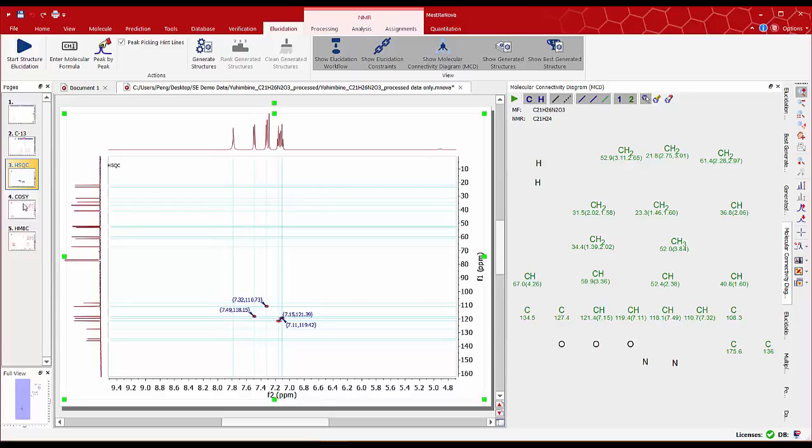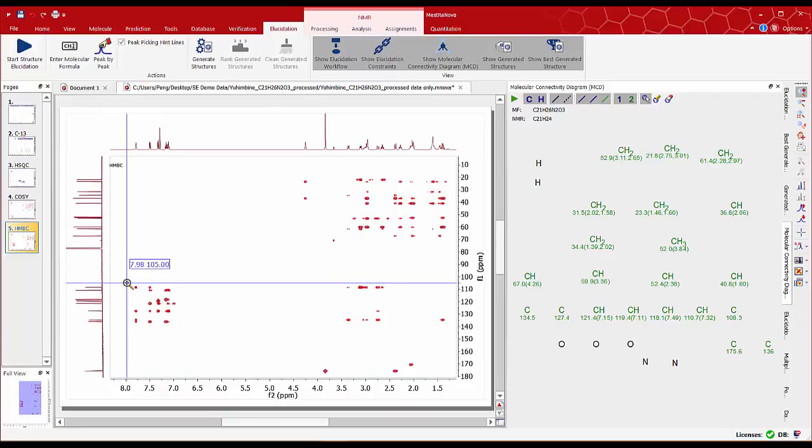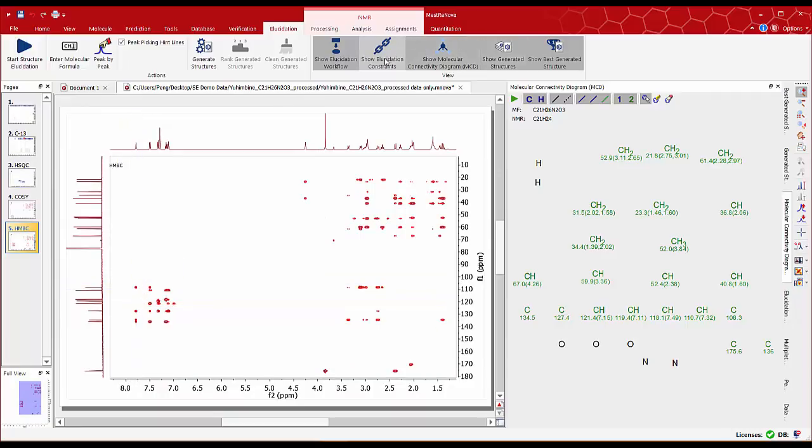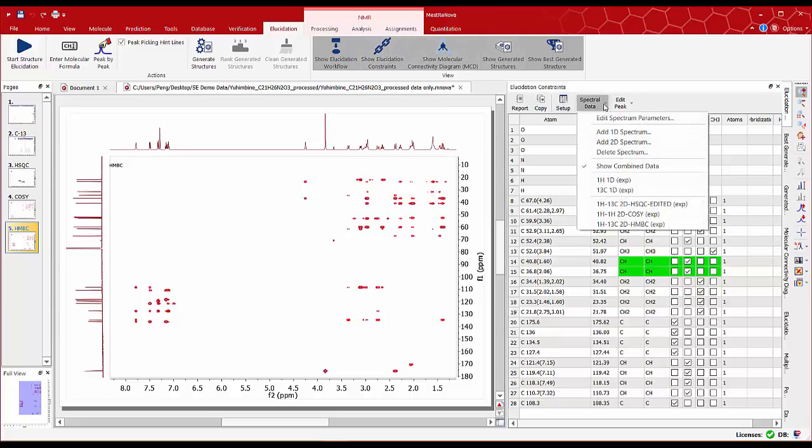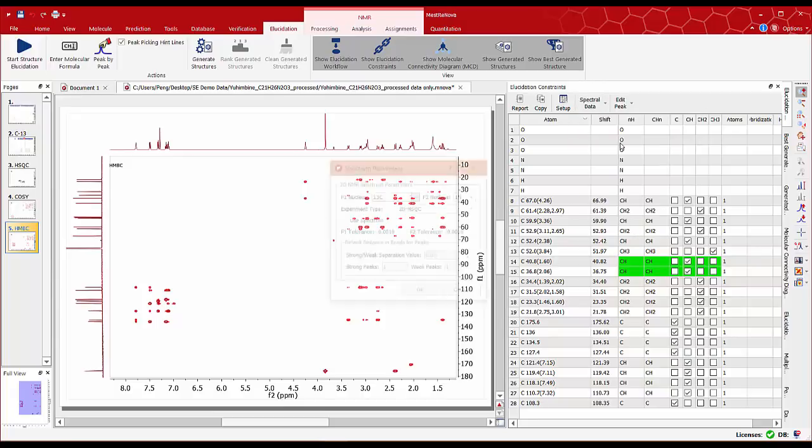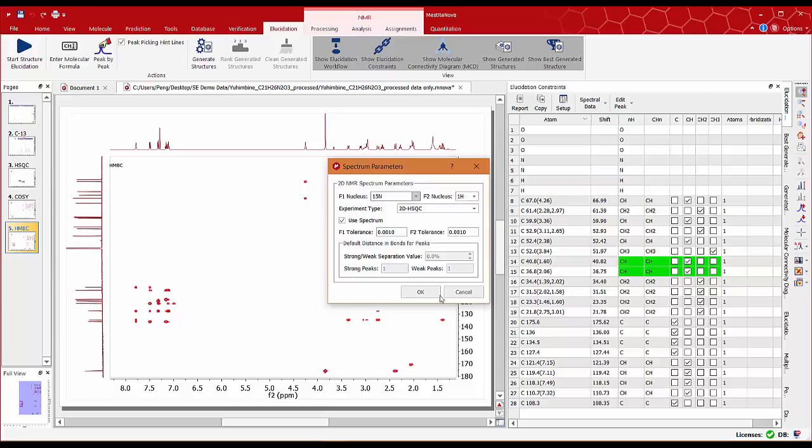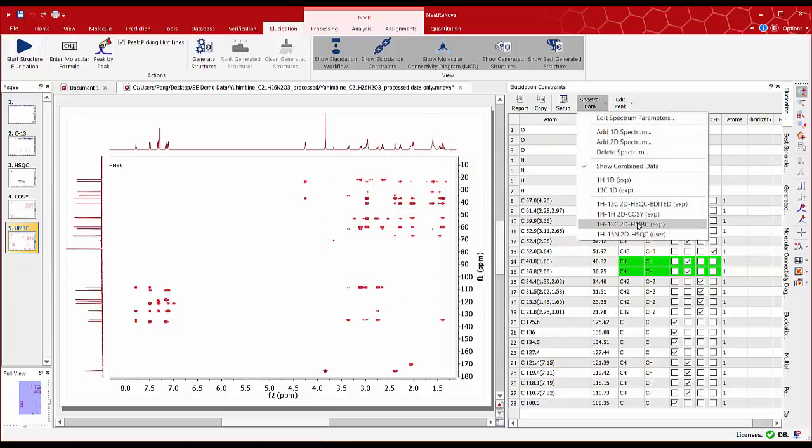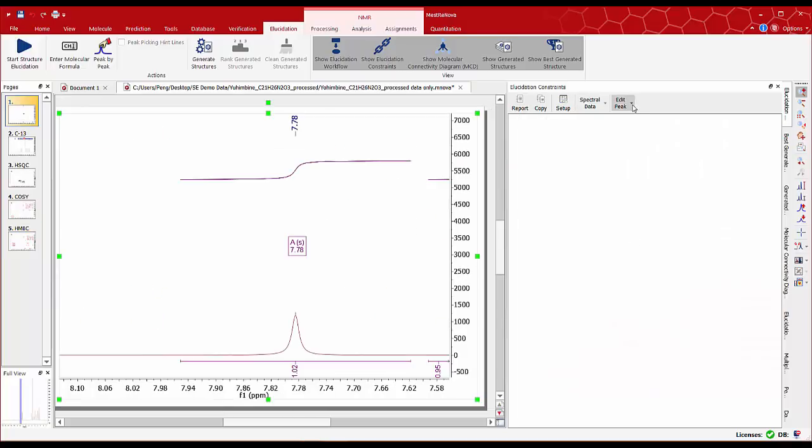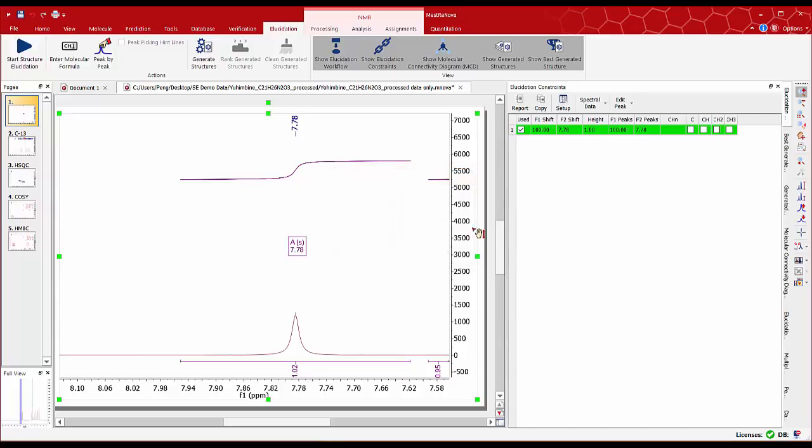Checking the correlations on the HMBC spectra for this proton we can see several CH correlations for it. Since we don't have a nitrogen HSQC spectra we can manually edit the elucidation constraints table and in the spectral data menu select add 2D spectrum and define the spectrum parameter options as nitrogen to proton HSQC spectrum. Let's get back to the user defined nitrogen proton HSQC spectrum and click add peak. Fill in the parameters 100 ppm for the nitrogen in F1 and 7.78 ppm for the proton in F2 and select 1 for distance in bonds.